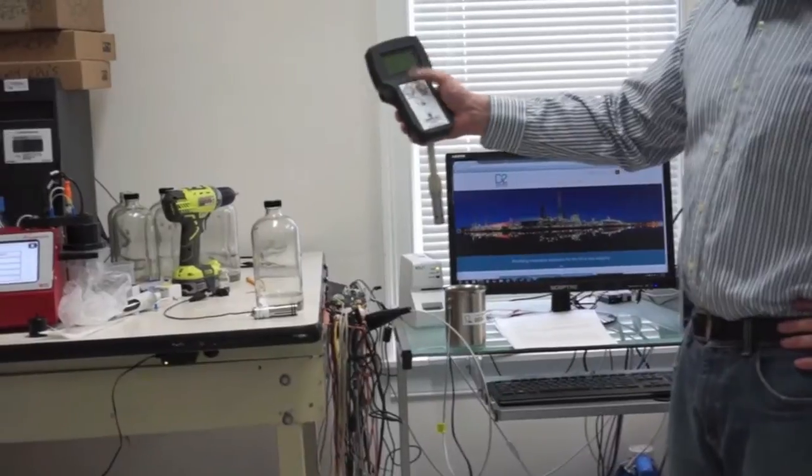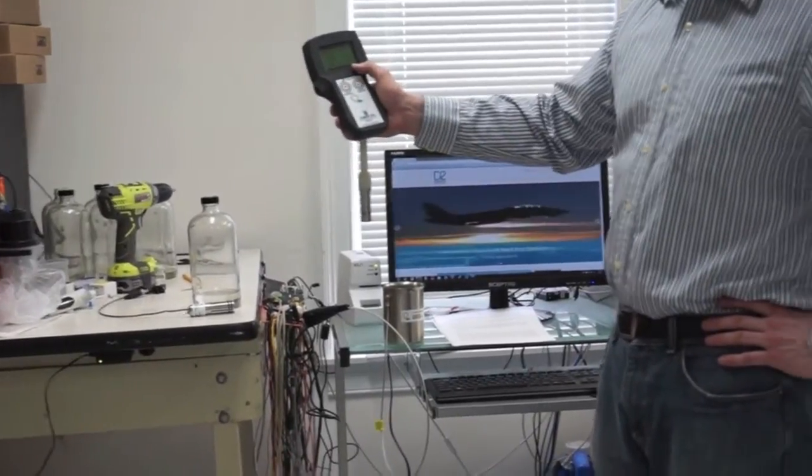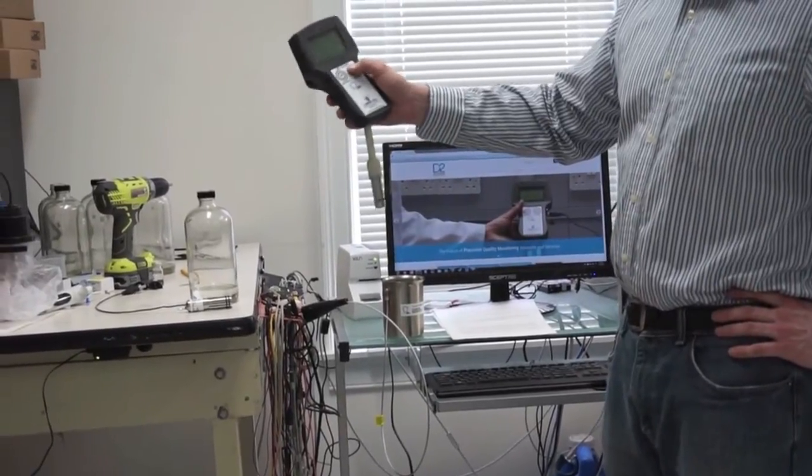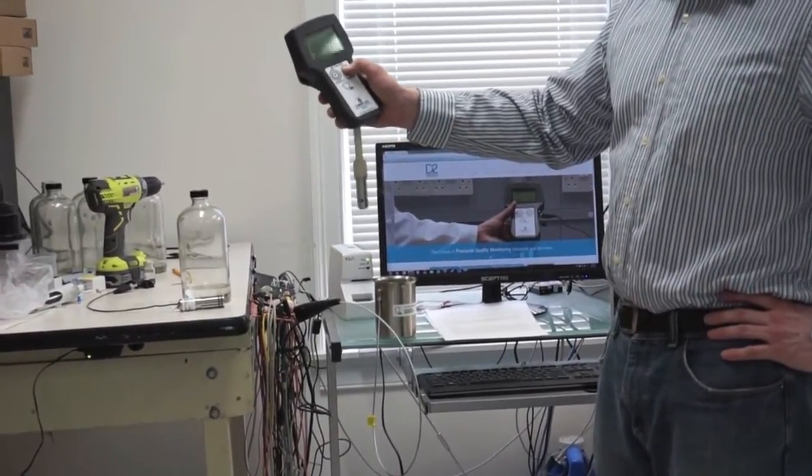Once you hit enter, you pick the position where you want to store the data. We're going to pick location zero, which is the first of eight data storage positions on the unit.